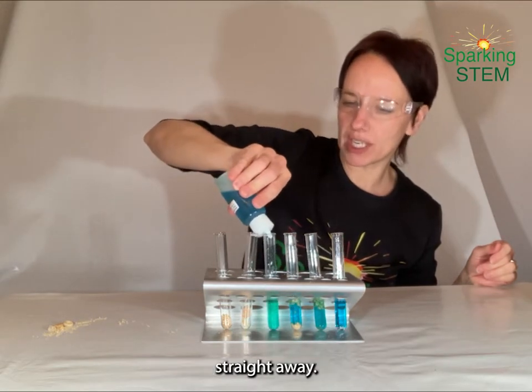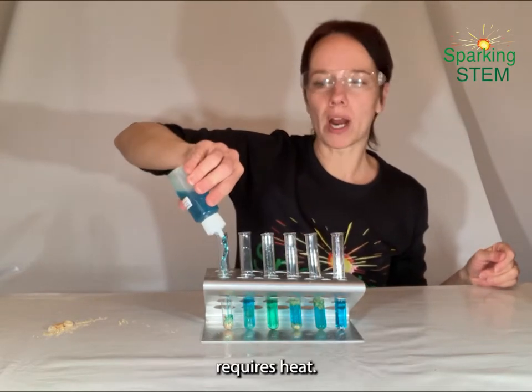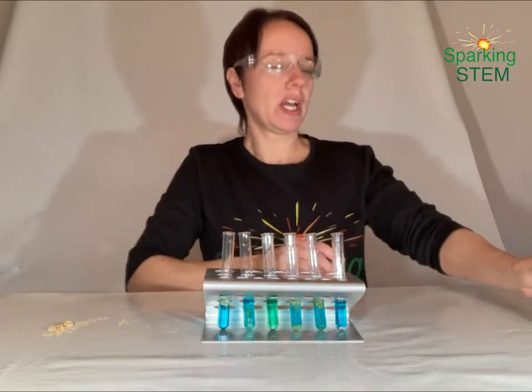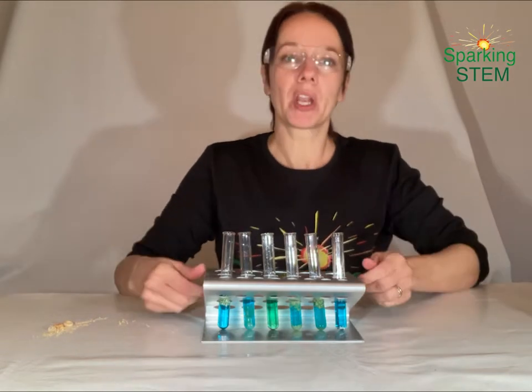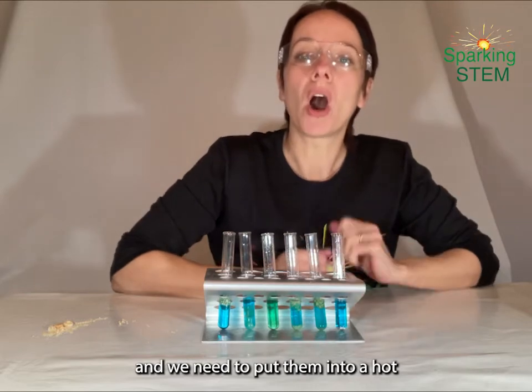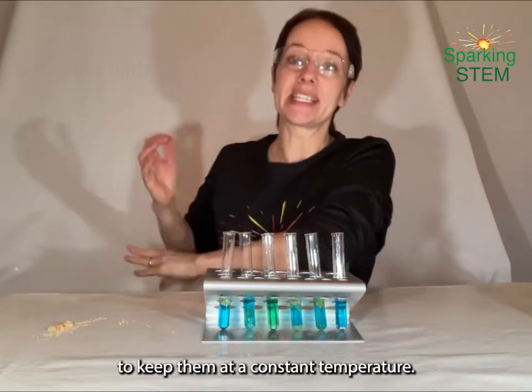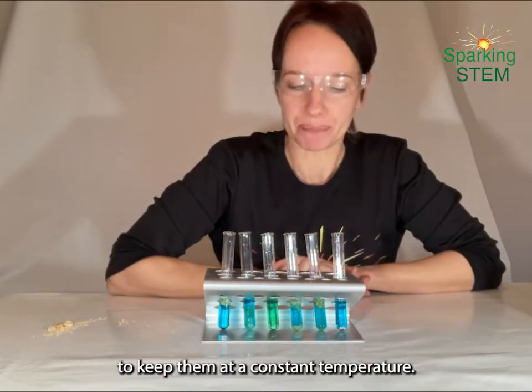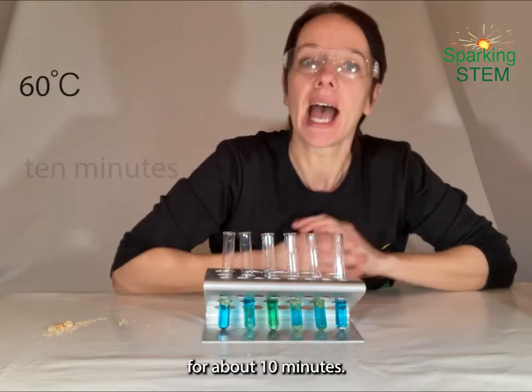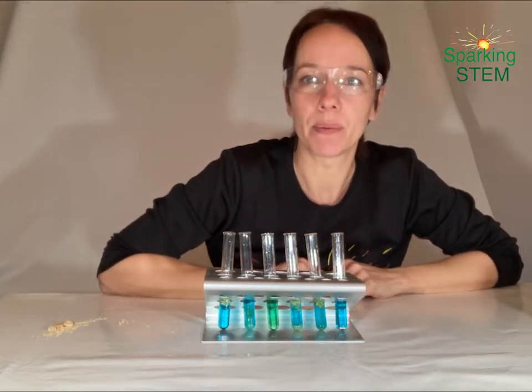Now nothing's going to happen straight away. This chemical reaction requires heat. So in order to find out whether or not there is glucose present, we have to take our samples with the Benedict's solution and put them into a hot water bath. That's not the kind of bath that you have a wash in at night — it's the kind of bath that we put chemicals in to keep them at a constant temperature. So I'm going to pop them in at at least 60 degrees for about 10 minutes.